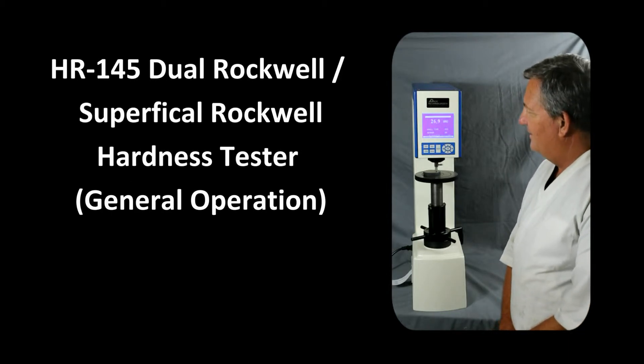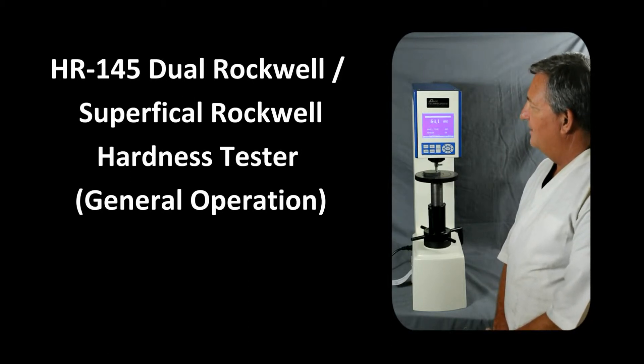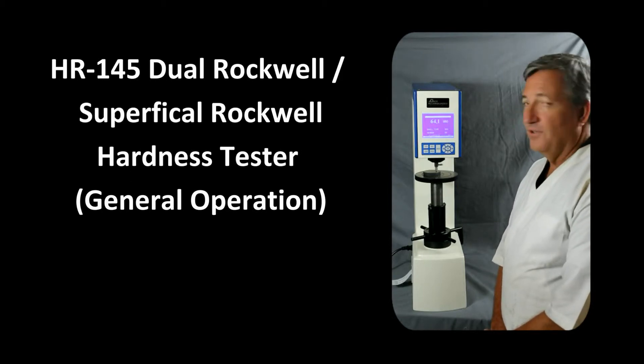Now it's counting down, and then the major load will be applied, which is 150 kg. We get a value of 64.1 HRC, which coincides with the standard for this test block.